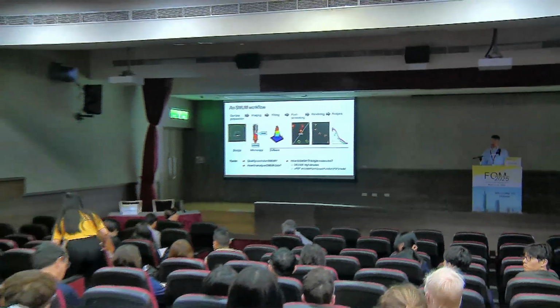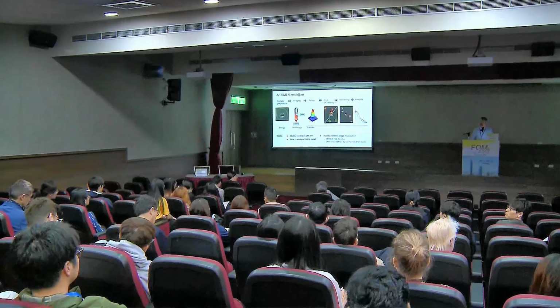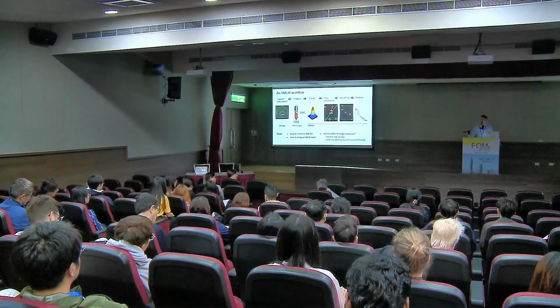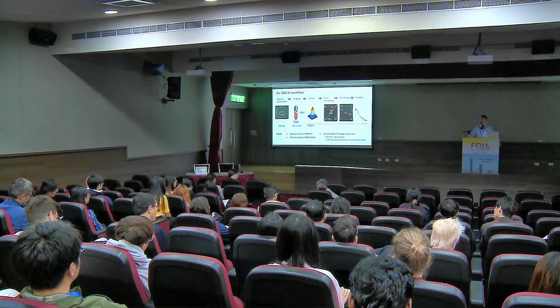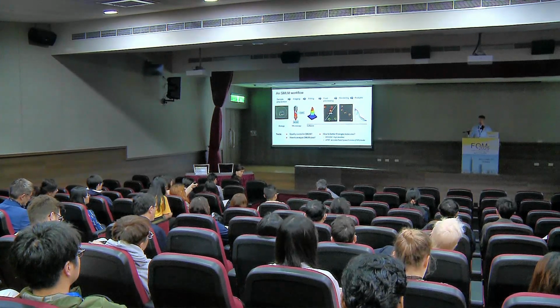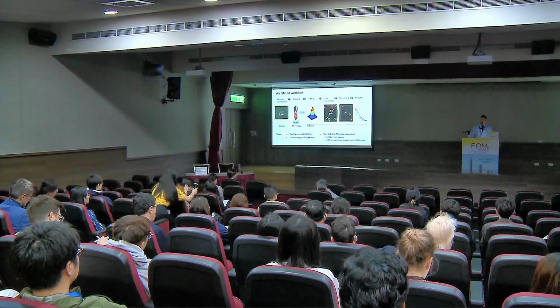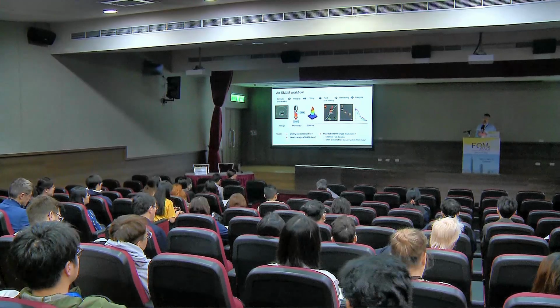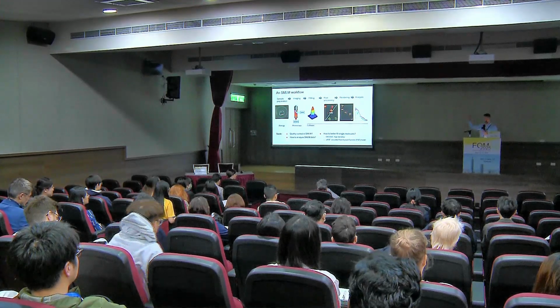Thanks for your talk. So I'm curious, can you already fit the aberration directly in the 4-pi model, in the 4-pi modality with UIPSF already? Yes, we can do this. It works especially well if you use beads and then do a phase scan in the beads.